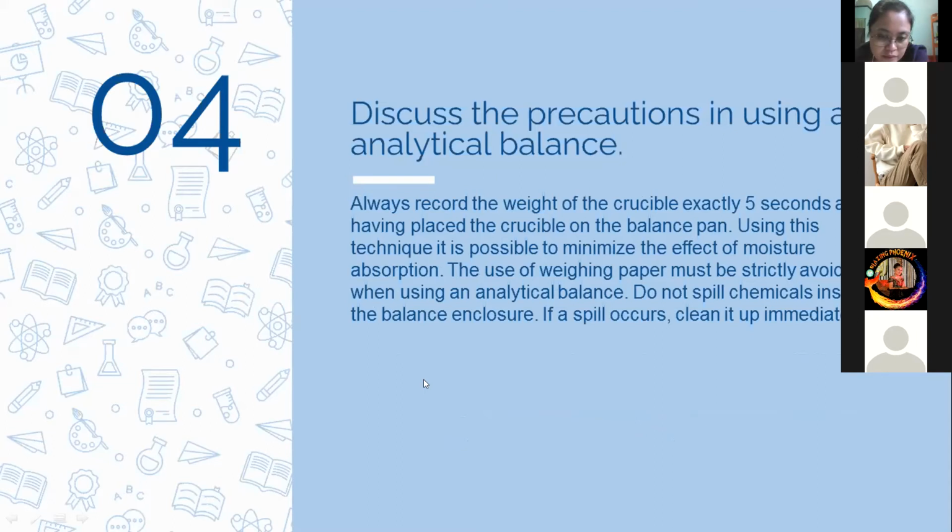That way, mistakes would not occur. Using this technique, it is possible to minimize the effect of moisture absorption.